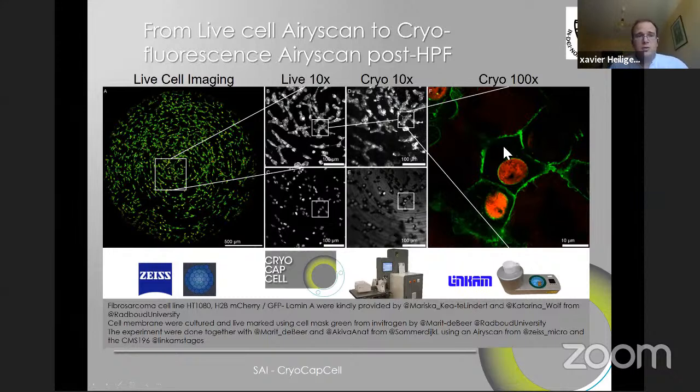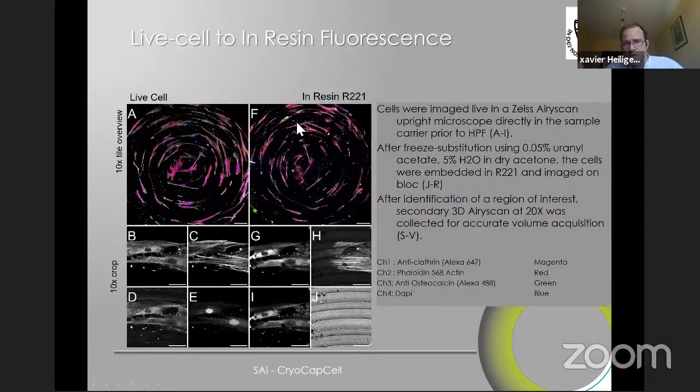Another way of doing things is to do live cell imaging, and then you are not really much interested in cryo-light microscopy. This depends really much on your scientific question, but you want to do in-resin fluorescence. This is something we've seen already before. The in-resin fluorescence is mostly using Lowicryl HM20 around the world. But one of the limits of HM20 is that if you want to preserve the fluorescence for doing in-resin fluorescence, then the resin will start to charge in volume electron microscopy, serial block face imaging, or focused ion beam imaging.